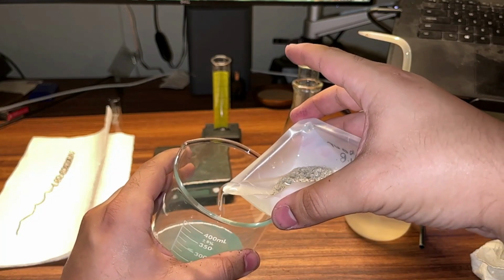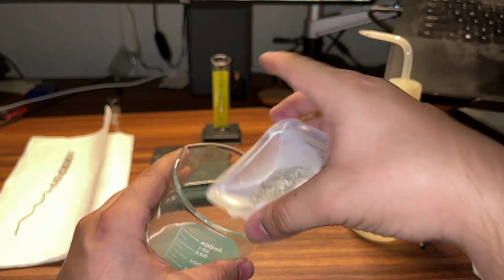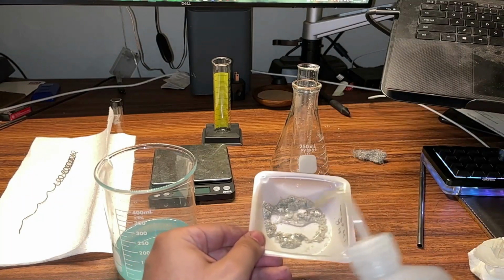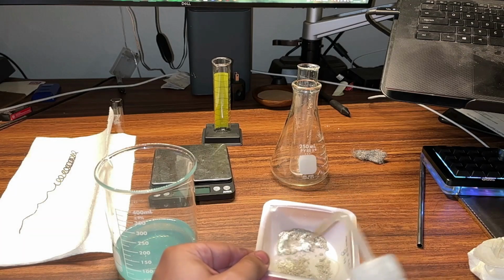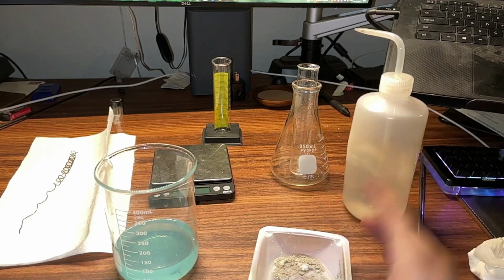So the sweet spot with rinsing, for this lab and for our purposes, is about 3 times. I'm going to do a 4th one just for fun. But I think the procedure asks you to rinse 3 times, and that's plenty for what we need.